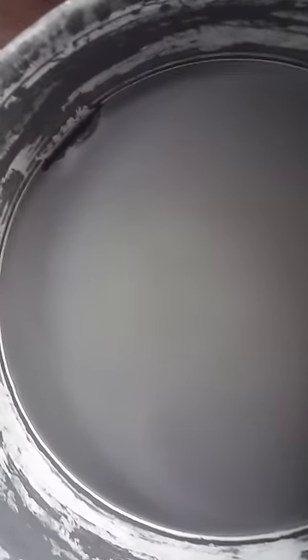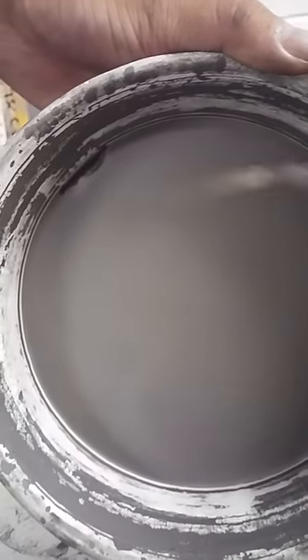Look at this — this is some of the test run. We're just taking some of the solvent and putting the graphene through its paces. Sorry, this is such a wacky thing, but this is how deep it is.